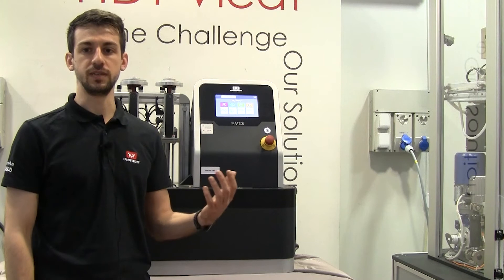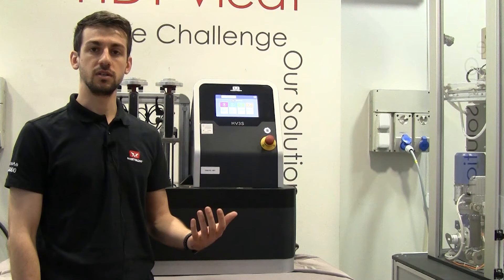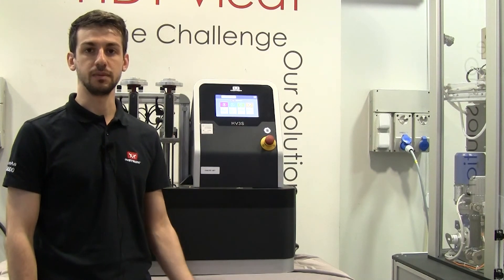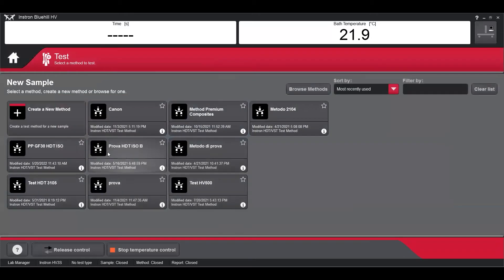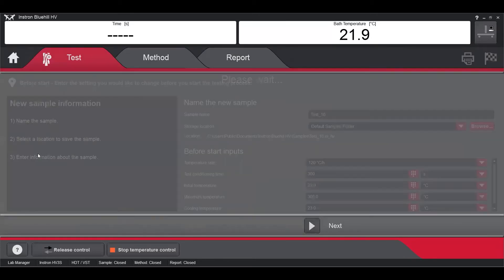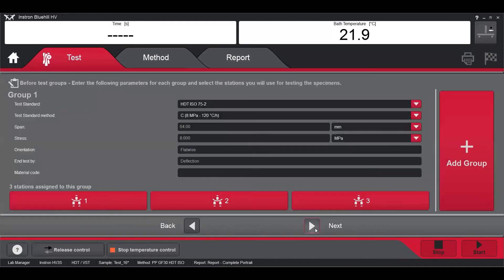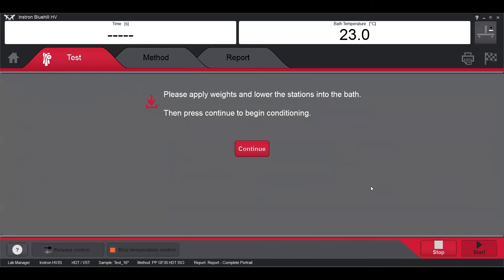With the BlueHill HV software I can be guided as well, but I can also collect additional information such as the real displacement plot against real time. What I'm going to do is simply go to the test section, select the already created method, follow the tab instruction by instruction, apply the weights onto the station, and then click to have the test started.